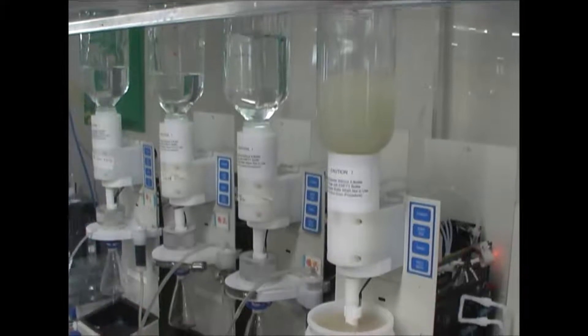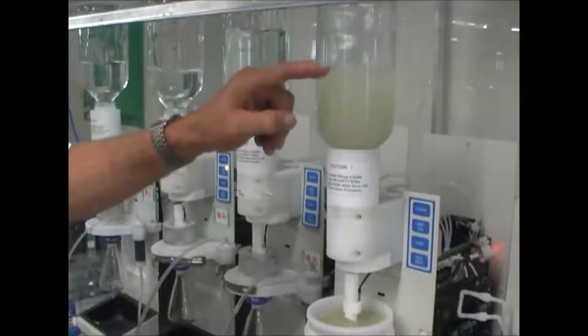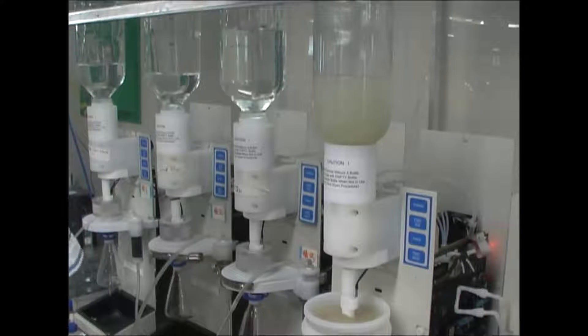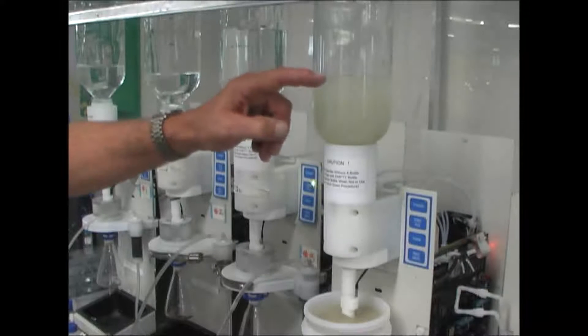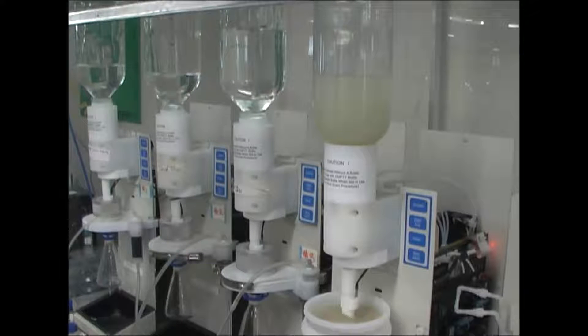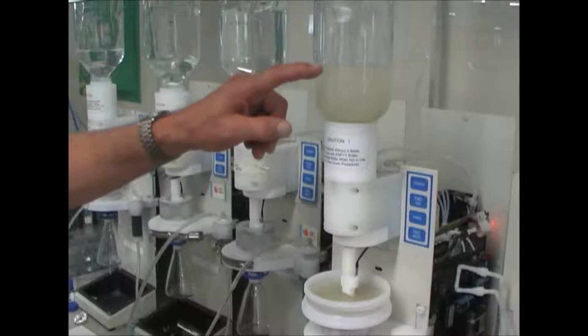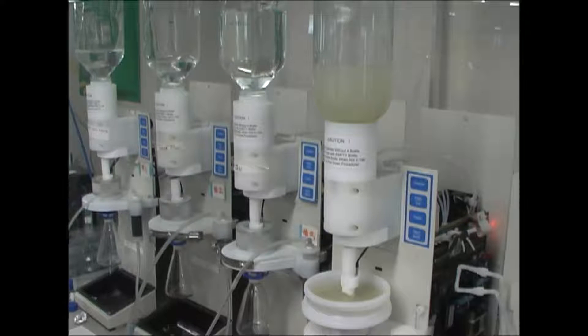That's three minutes into the run, and we can see that we're just almost halfway through. That's four minutes into the run, and we're just a little beyond halfway. That's five minutes into the run, still coming down with a nice flow.